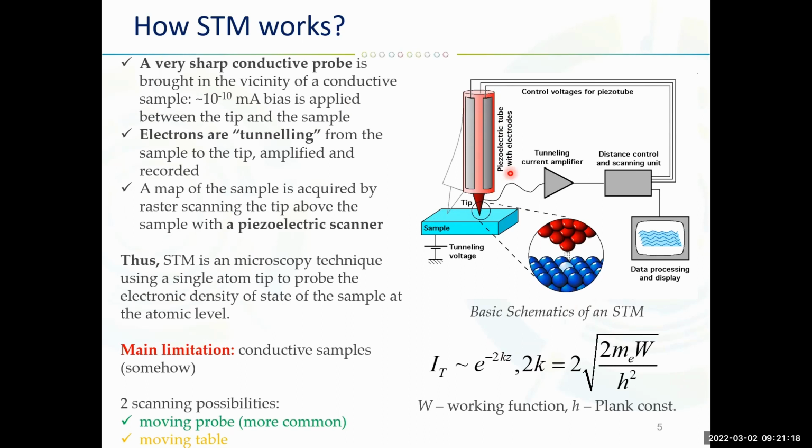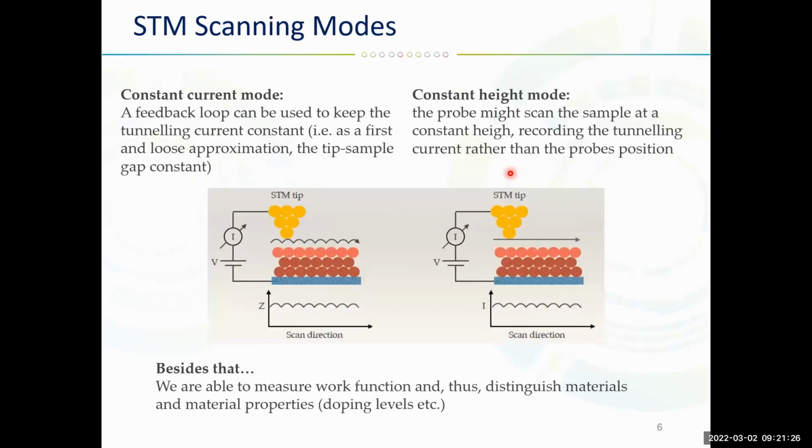Okay, so that was just a reminder of what we had last time. So, closer to the new stuff: STM scanning modes. Normally, there are two modes of operation for STM. It is constant height mode and constant current mode.